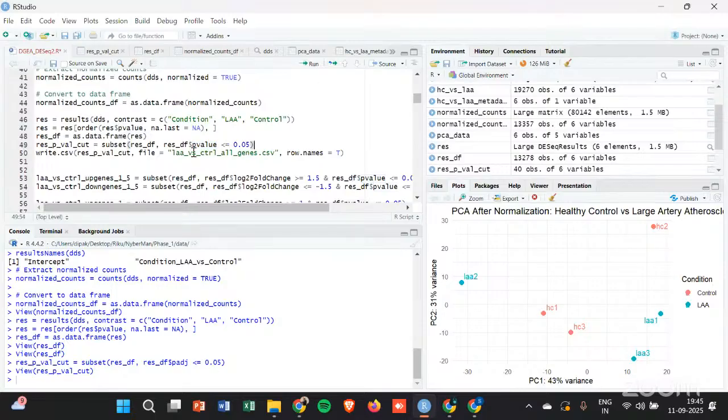Okay, so here I will keep p-value only, but ideally if you have enough genes for p-adjusted, you should use p-adjusted. You can ask how many genes are enough. There is no real correct or wrong answer to it. It is completely based on your analysis.